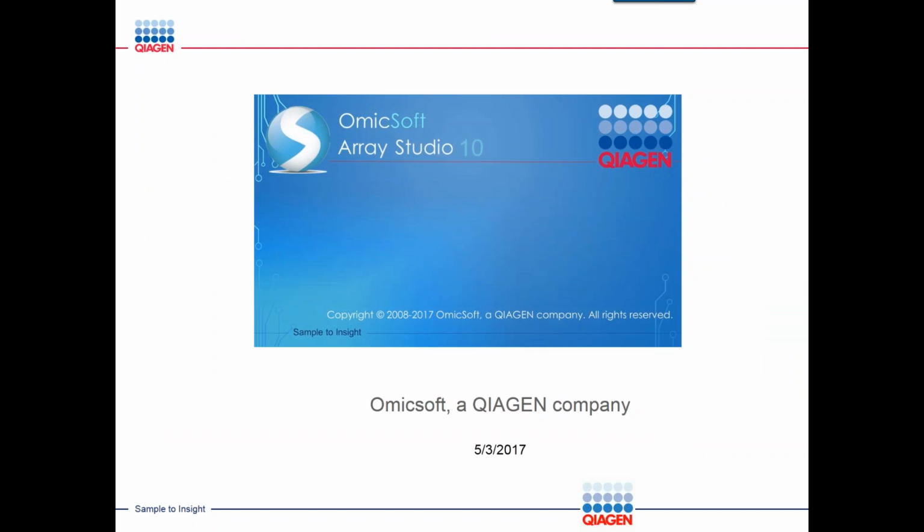Hello, everyone. This is Jack Liu from QIAGEN. I'm very excited to present to you an incoming new release of Array Suite. This is Array Suite 10.0 from the Omicsoft team, which now is part of the larger QIAGEN Bioinformatics group. I hope that you will find the information to be interesting and useful.